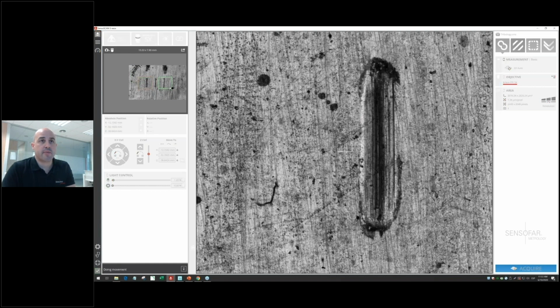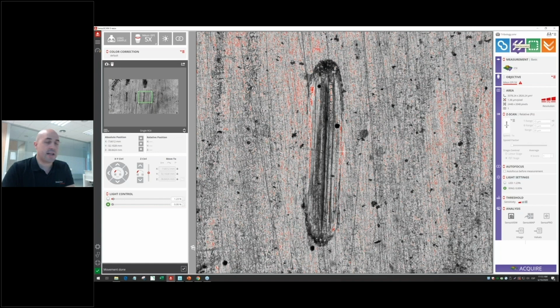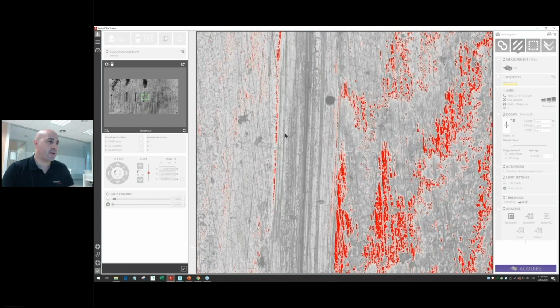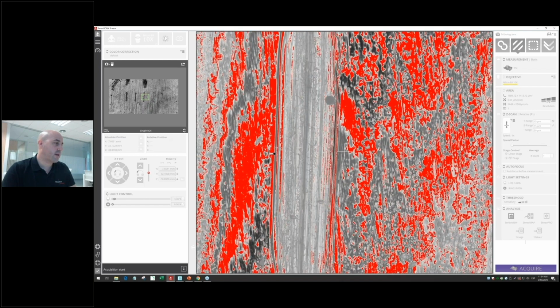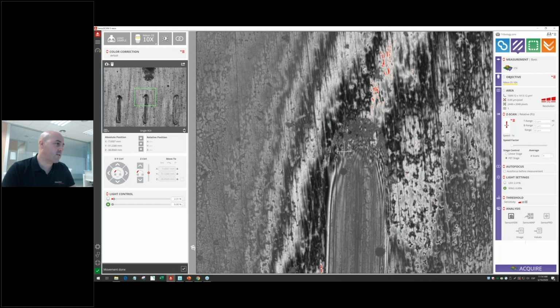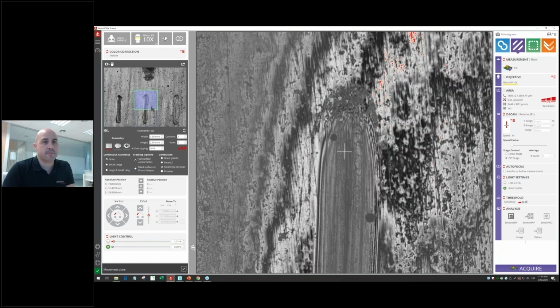If we want to take a measurement here, I will select, for example, interferometry with a 10x lens. I can do auto light. I can focus manually or with autofocus. Click again, auto light. Now, if we want to cover this part, I can zoom in, select the first part, and indicate to the software to go from here to here. Automatically the software tells you that you need to take 2 acquisitions.